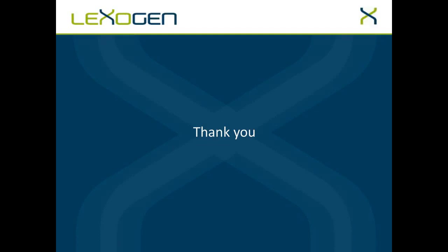However, if you later want to monitor the consistency of the quality, it might be enough to just use one of the mixes, and we would recommend E0, because already here you see the deviation in the quantification. So it's up to the application which mixes you should use.